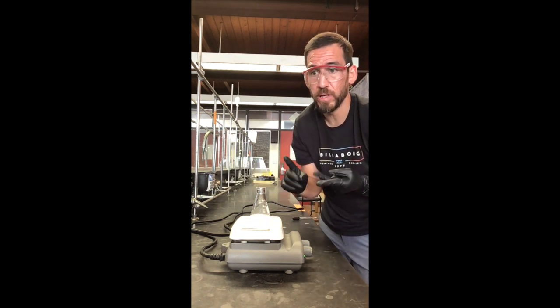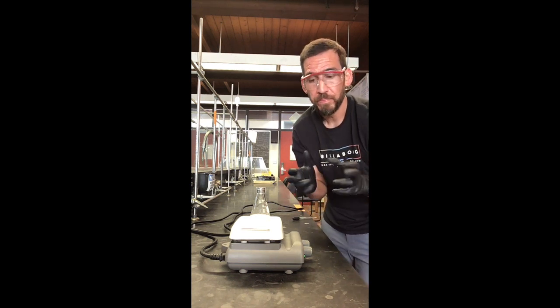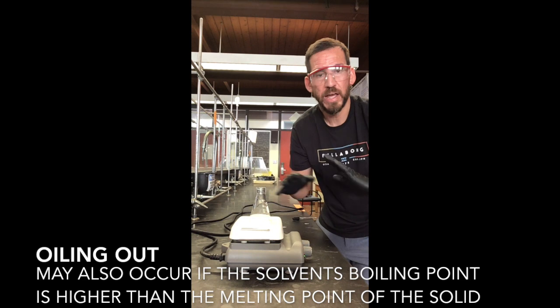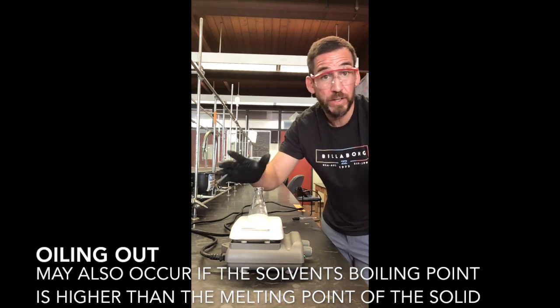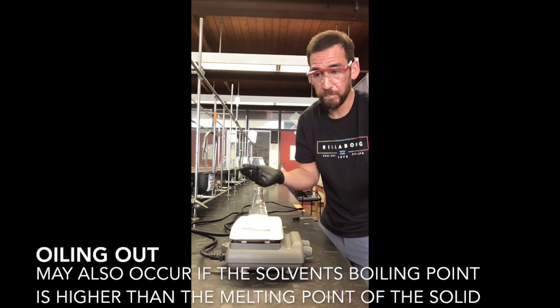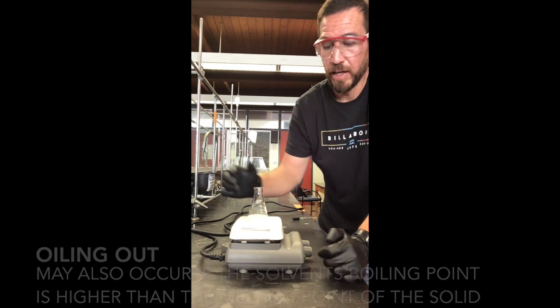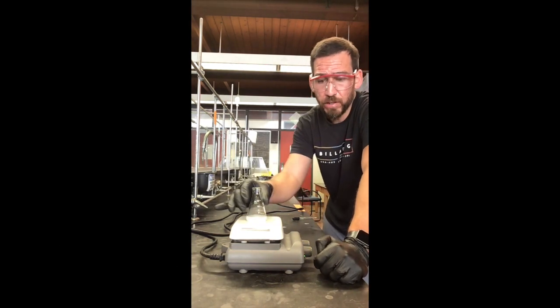You don't want to melt your substance, because once you melt your substance, something called oiling out will occur, and it's just going to ruin the recrystallization process, and you're going to get like a poopy brown oil on the bottom, for example, and it's never going to form nice crystals. You're not going to purify your substance, and you're going to be really upset, right? Because you're trying to get lovely crystals of caffeine. And so that's why you want to make sure you add solvents to your solid material before you start heating it.